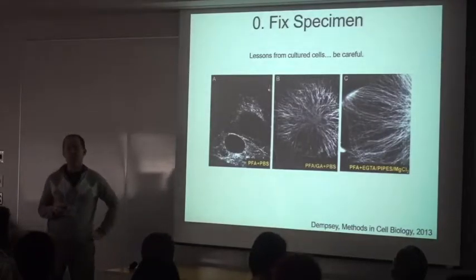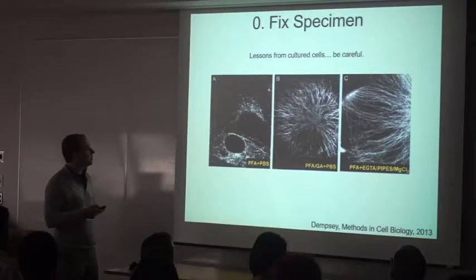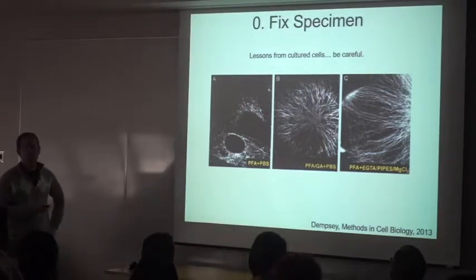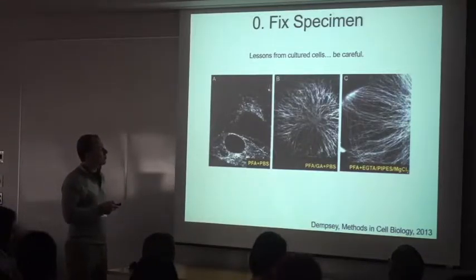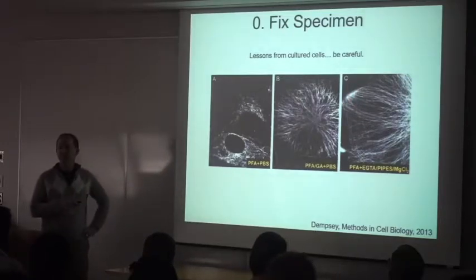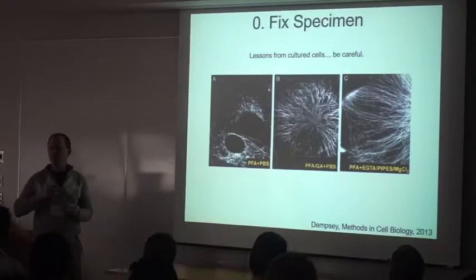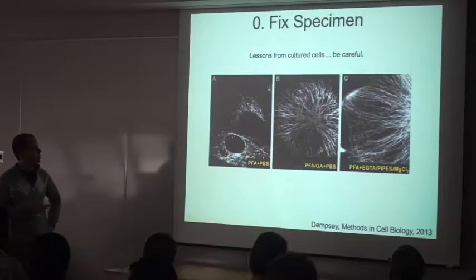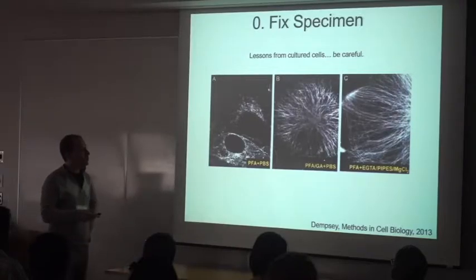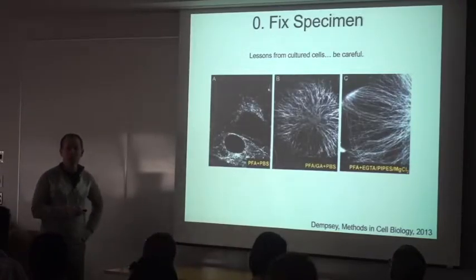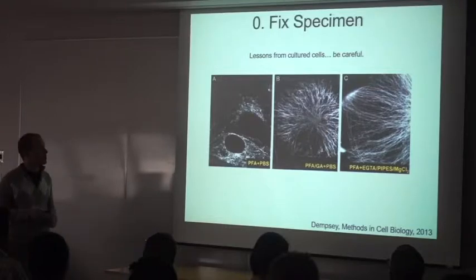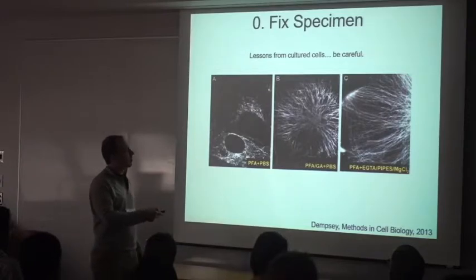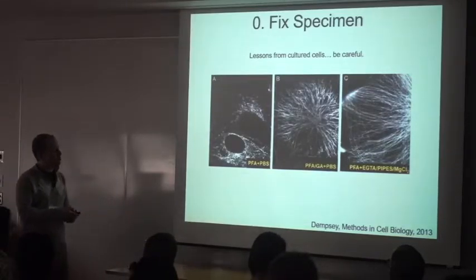Let's talk about fixing the specimen. You want to preserve your structure of interest. This is three types of fixation conditions for microtubules in a cultured kidney cell. Fixed with just formaldehyde, it gets blown up - microtubules are dynamic, they undergo catastrophe. Fixed with glutaraldehyde in the mixture, it's much stronger fixative, microtubules are preserved really well.